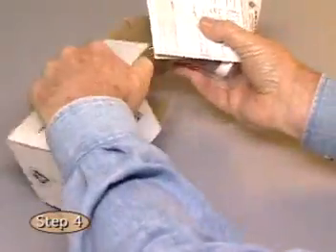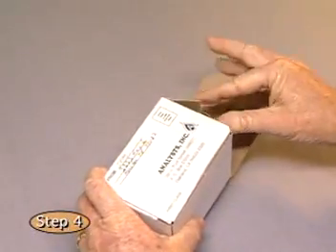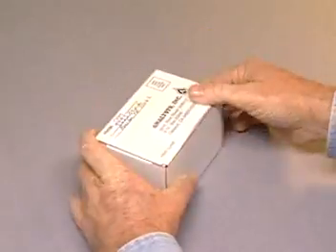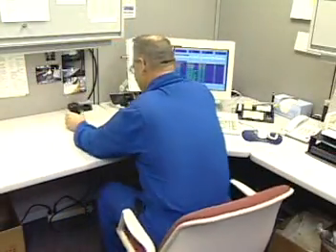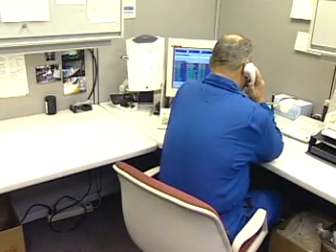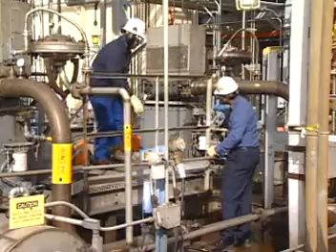Promptly send the sample to the laboratory using first class mail, UPS, FedEx, or other reliable commercial delivery service. Do not set the sample aside to send later for any reason. Should the sample contain clues to a problem, you want to know as soon as possible. Your equipment may depend upon it.